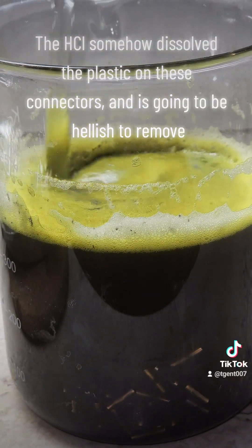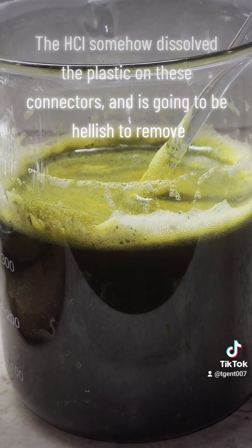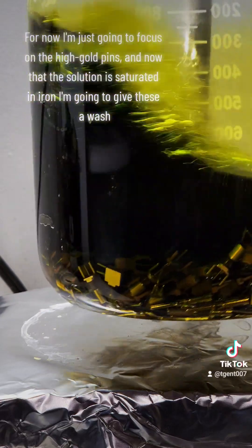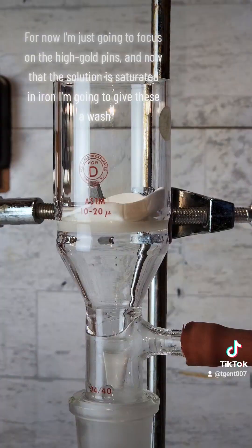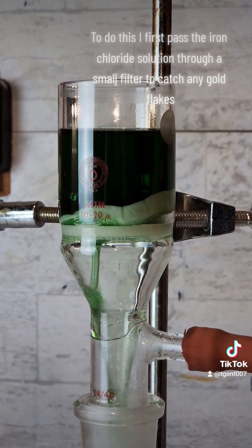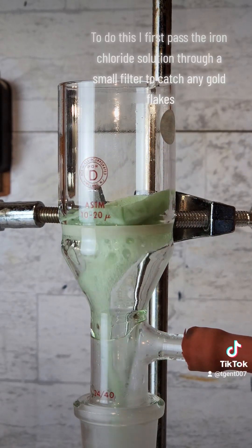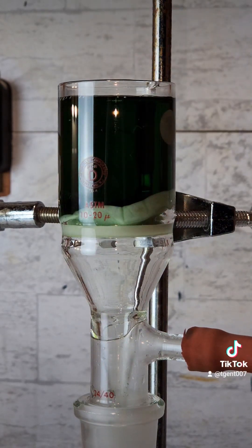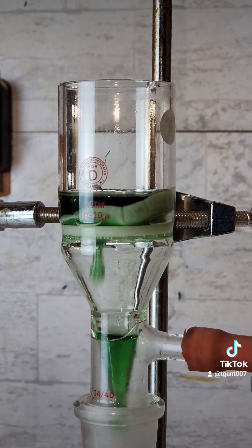The HCl somehow dissolved the plastic on these connectors, and is going to be hellish to remove. For now, I'm just going to focus on the high gold pins. Now that the solution is saturated in iron, I'm going to give these a wash. To do this, I first pass the iron chloride solution through a small filter to catch any gold flakes.